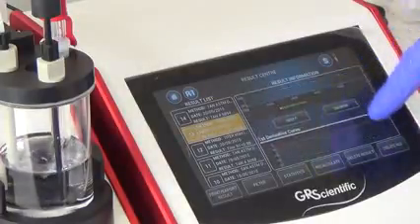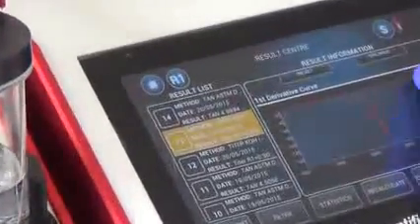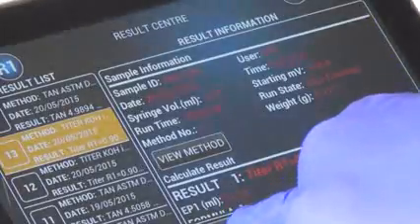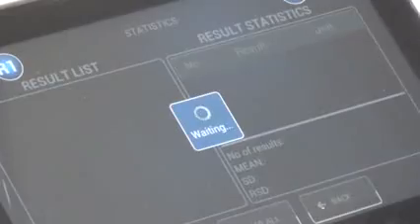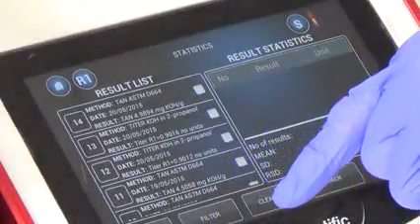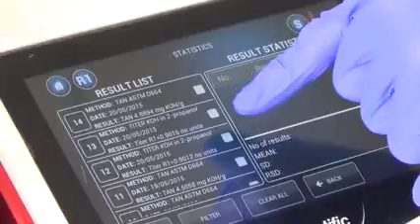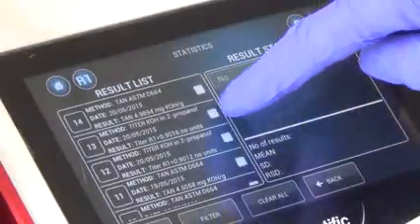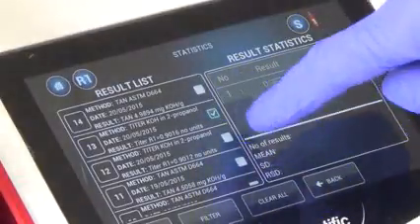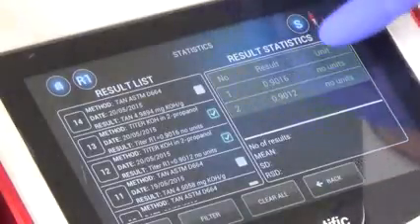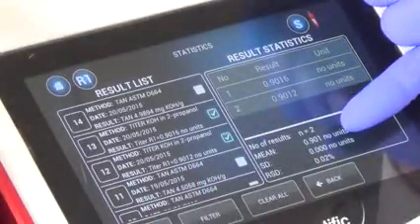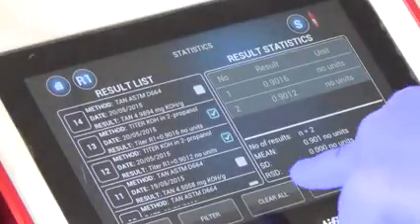Statistics. And there's the curve. As you can see, you've got a very nice inflection point there and a nice peak. And if I hit statistics, the left-hand side lists all the results you have. Depending on what you want to do statistics of, these little yellow boxes you must activate. For example, if out of the standardizations I ran, if I activate this one, and then this one here, you can see the results appear this side. Press statistic. And there we go. You have your mean, your SD, and your RSD. And then I can just clear all.